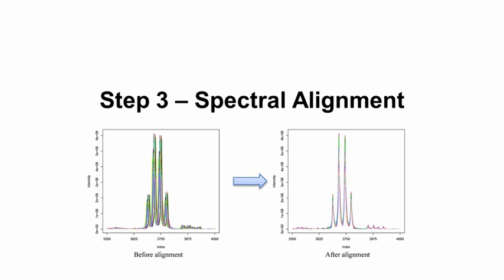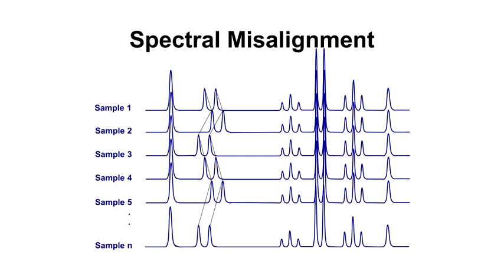Now, this is a particular problem with LCMS and GCMS-based metabolomics. It's less of a problem for NMR-based metabolomics, but it still is a problem. This is an example of what one might see, where you're collecting many, many spectra and you have everything nicely scaled and beautifully oriented, everything collected very precisely, and what you see is a whole bunch of peaks that are moving back and forth. These doublets that we're looking at are shifting. Clearly it's the same compound, but for whatever reason they're moving.